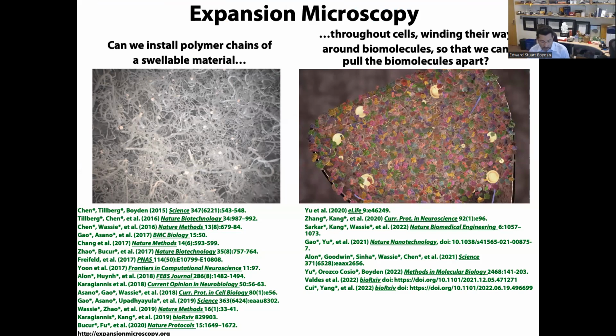The reason we started this project was the difficulty of nanoimaging. Biological molecules, genes, gene products, and other biomolecules are very small, nanoscale, and they're often organized with nanoscale precision. But if you want to image them in a cell or a tissue or an organ or even an entire organism, that's difficult.